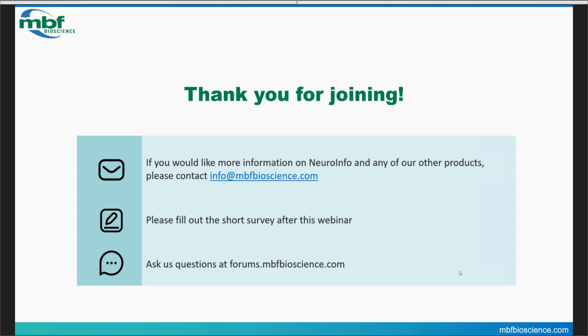I should also have said that we have 2 microscopes, so we can run 2 microscopes at the same time, and 4 computers, so we're running a lot of this processing. A lot of it is waiting. We start the program and then it runs.